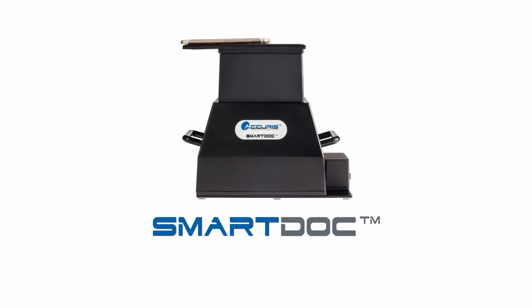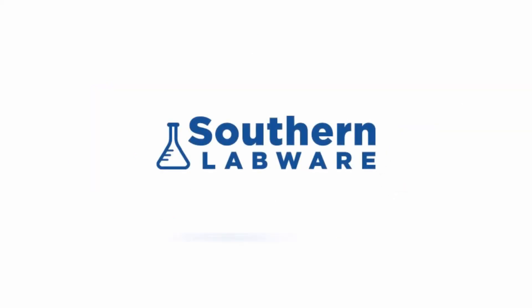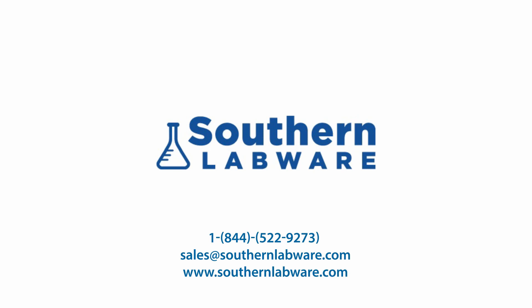The SmartDoc 2.0 is a convenient and economical solution for any life science lab. Contact us today for pricing and ordering information.